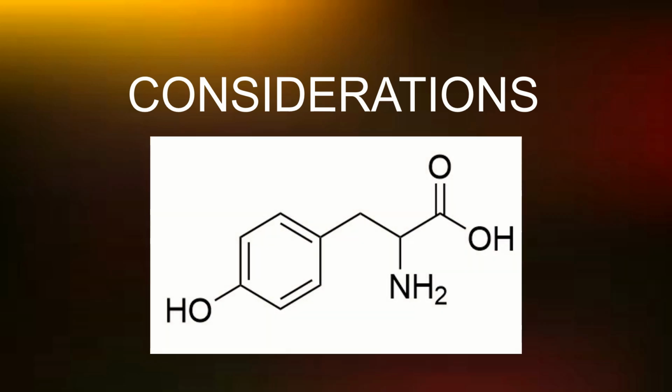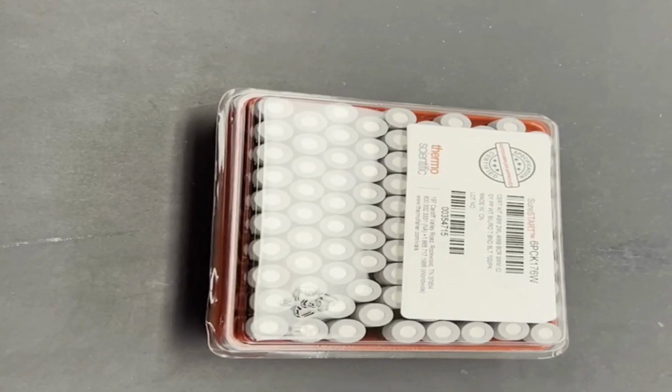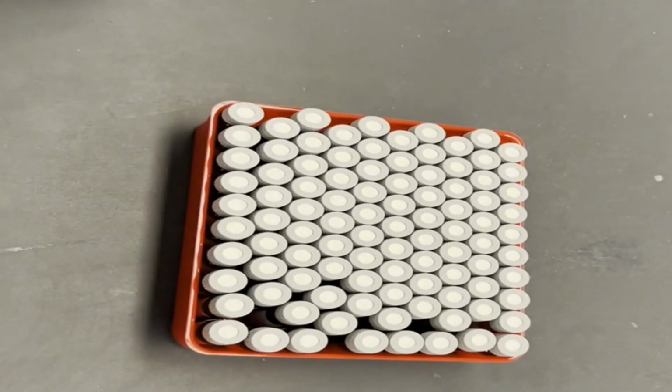Tyrosine does not have multiple amine groups, however its hydroxyl group can interact with Marfey's reagent. By raising the pH of our solution during derivatization, we can push the equilibrium towards the disubstituted form. Our samples are still cooking, so we can get the last steps prepared ahead of time as well.